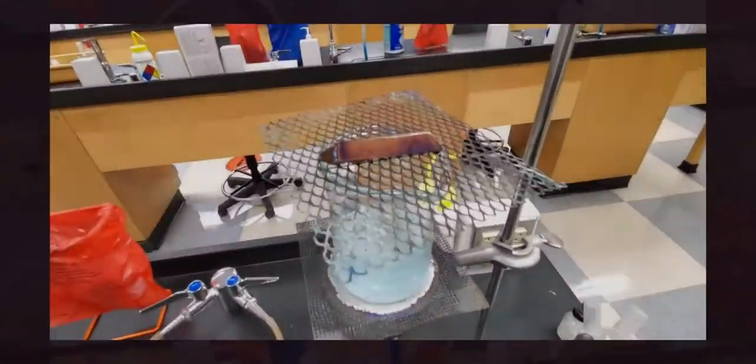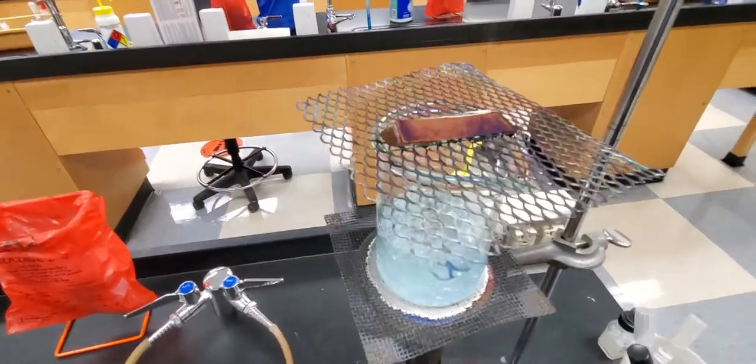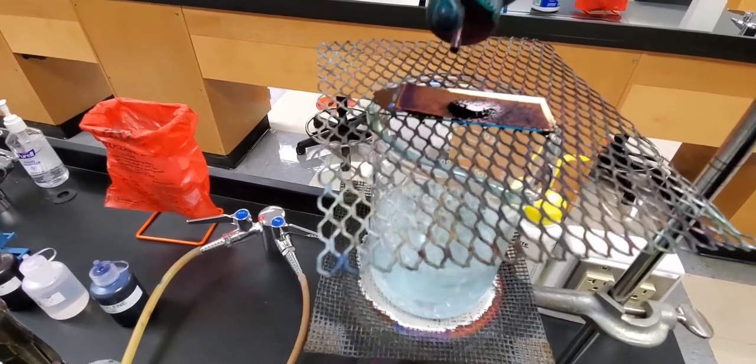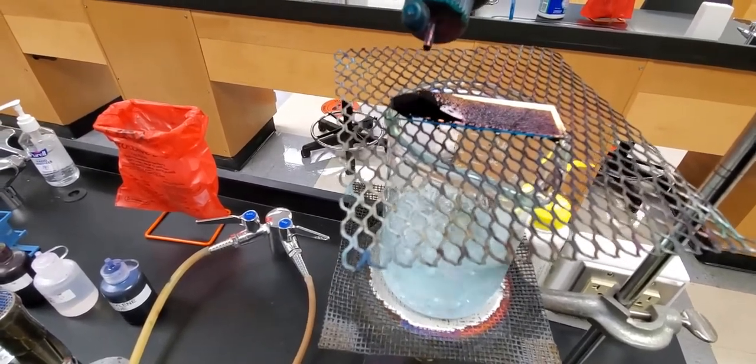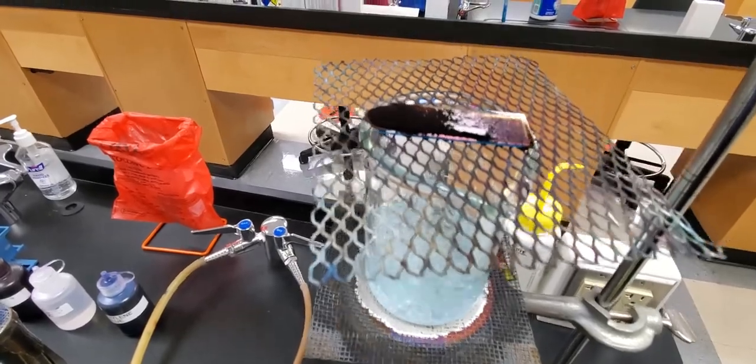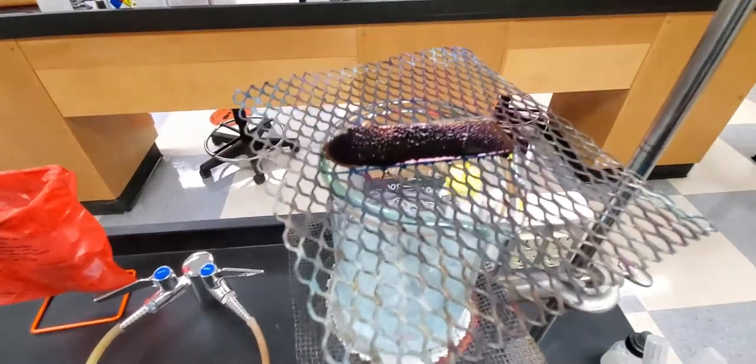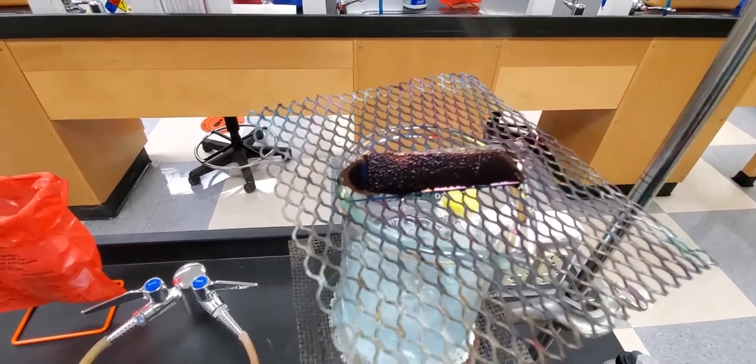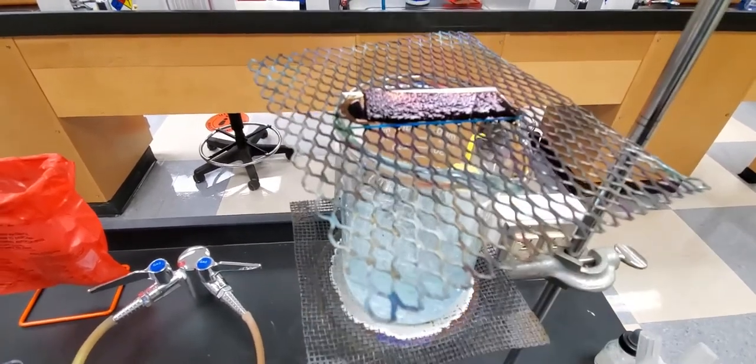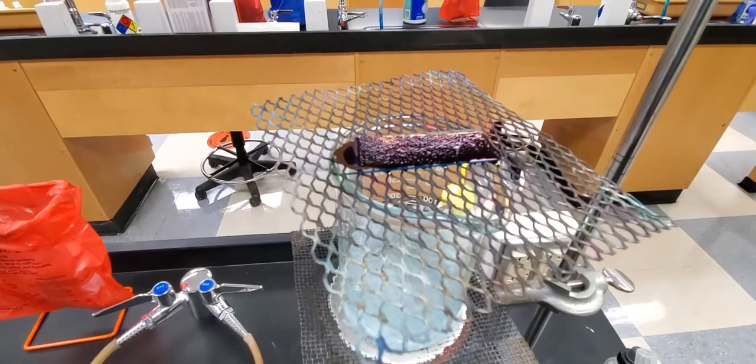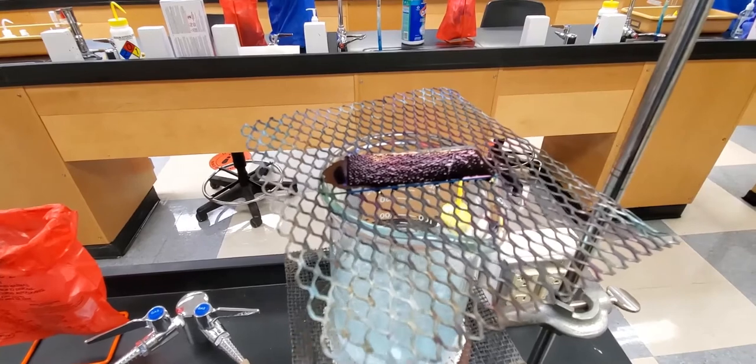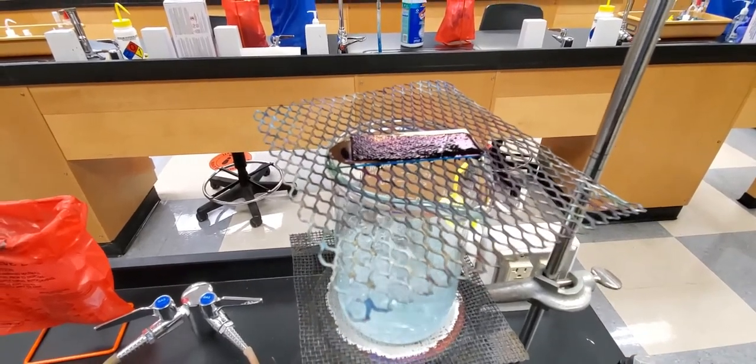You can see that our endospore stain is starting to dry out a little bit on top so we apply a little bit more of that dye. That paper towel again helps to keep it moist. We just want to keep adding that over this time period. It's been about a little over five minutes at this point. We want to make sure that we keep administering that dye to allow those cells to stain.